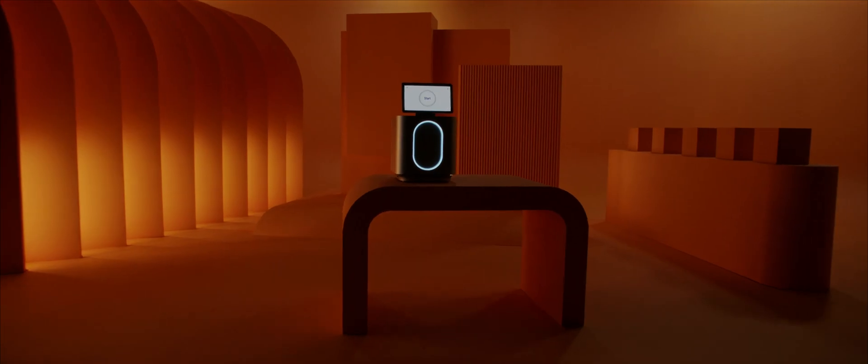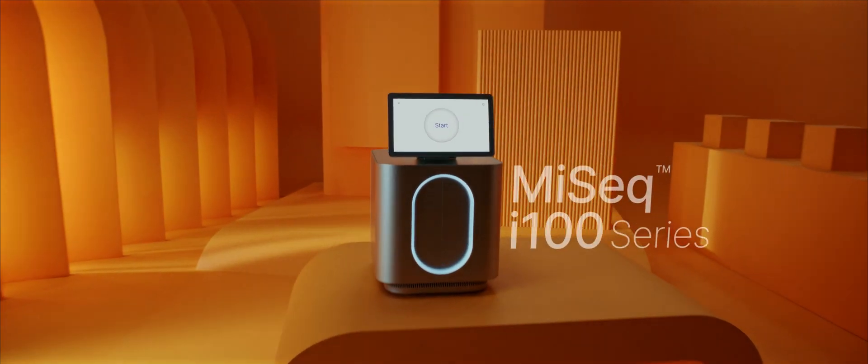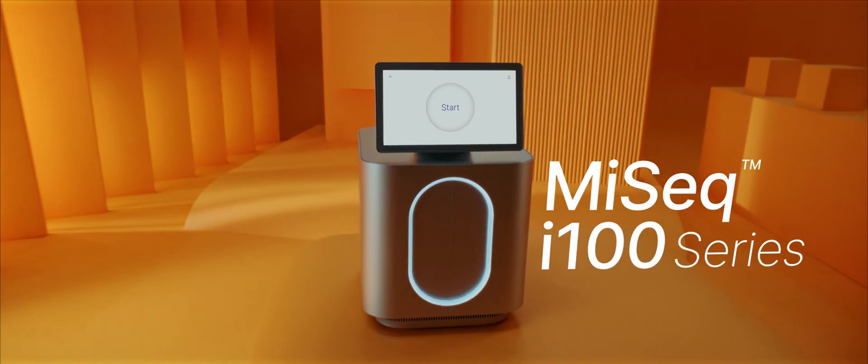Illumina first brought NGS to the benchtop more than a decade ago and continues to set the standard for simplicity and speed. The MiSeq i100 series.